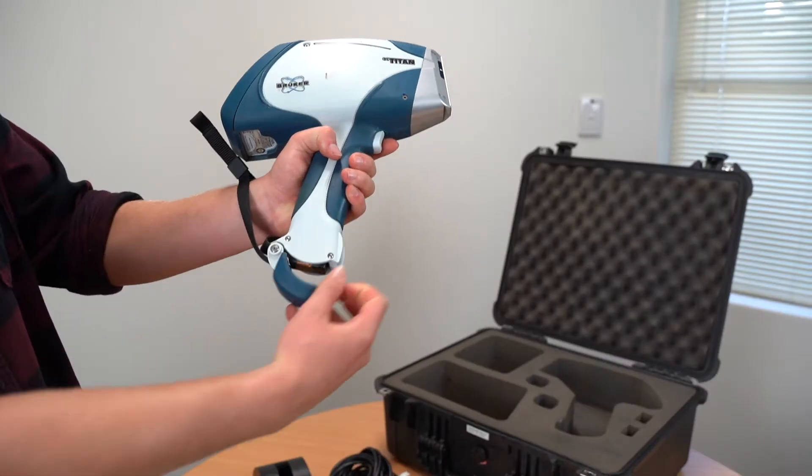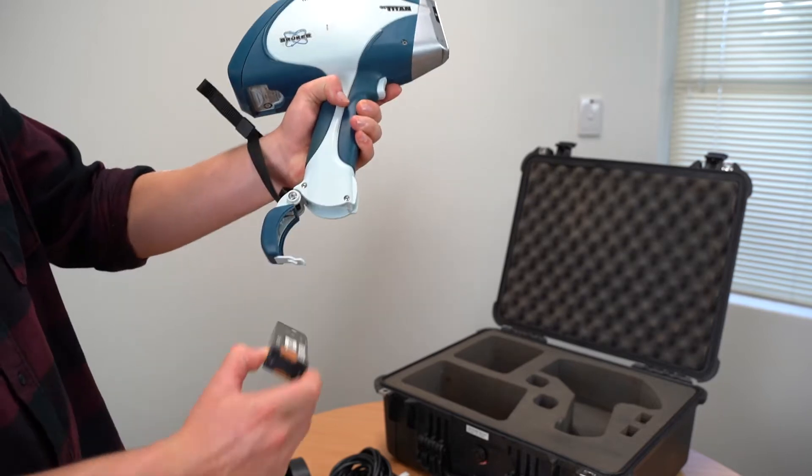The first step should always be to remove the battery. This is to ensure you are adhering to radiation safety conditions.